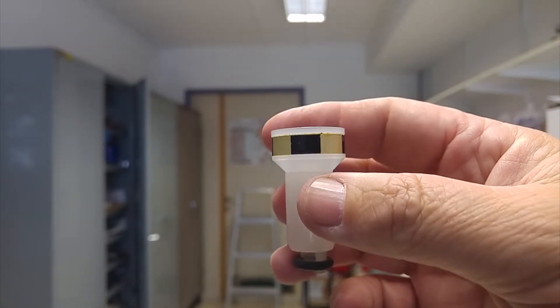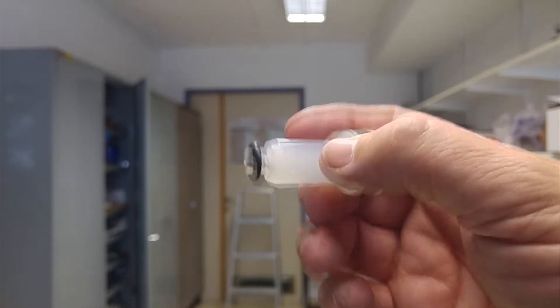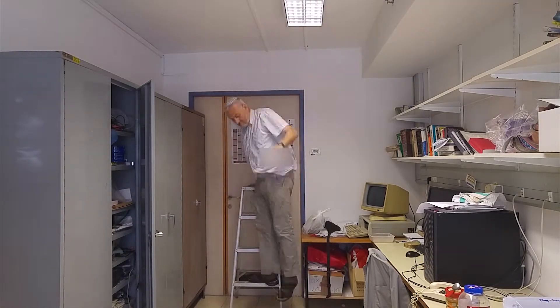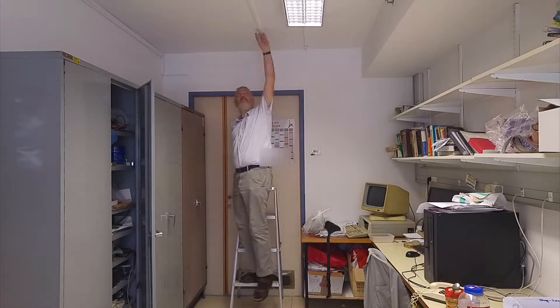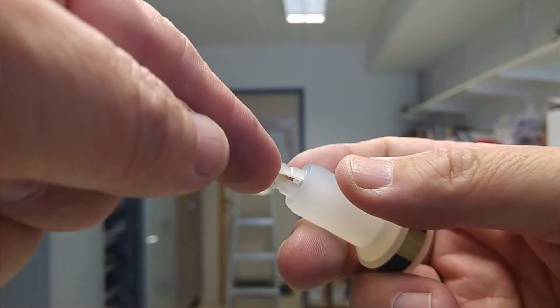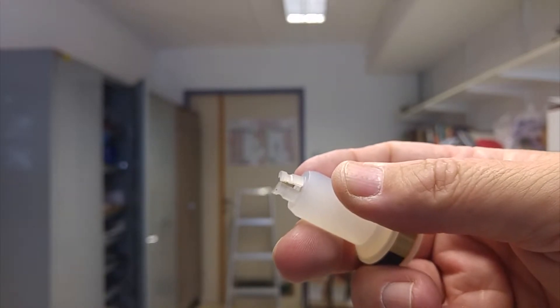This is one of the older but high quality Brooker spinners, but after many years of use it also broke, so we're going to try the drop test on this one. After twelve times dropping, this broke here — it came loose. So yes, this is more resilient.